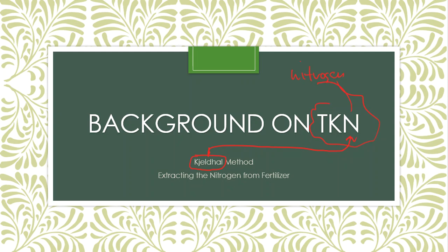Now, let me write that in white. Maybe that's a little bit easier to see. Okay, so TKN. T, what does that stand for? If K is Kjeldahl and N is nitrogen, what does the T represent? The T is going to represent the word total. So TKN means total Kjeldahl nitrogen.